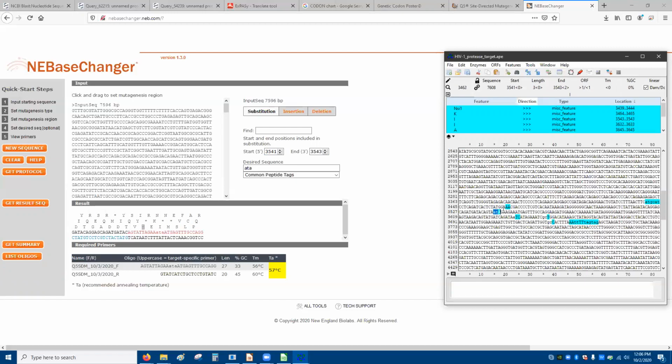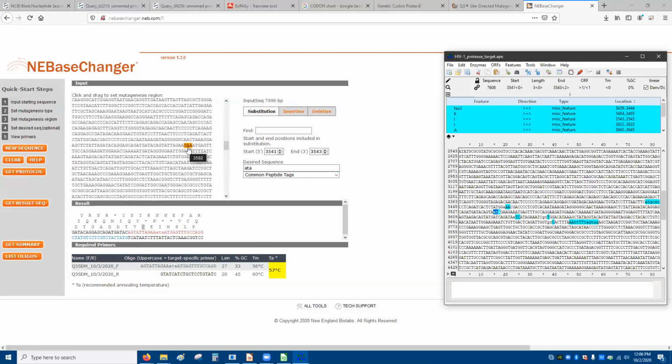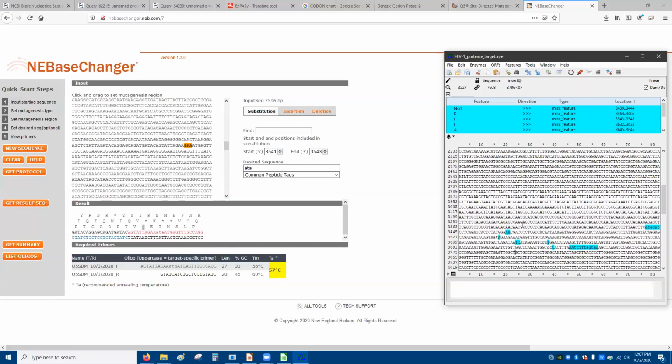Correct. There it marks it. We're changing GAA. Which GAA is what? E. Seem right. I don't know what this is. Yeah, it's the changes we want. Okay, I don't know.